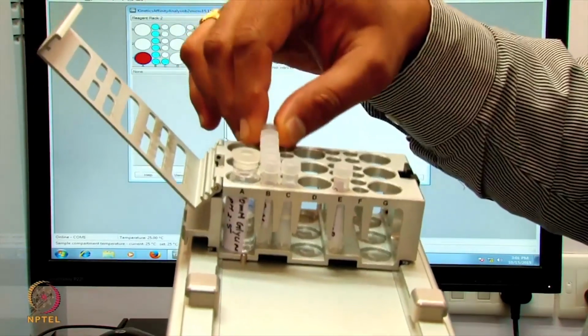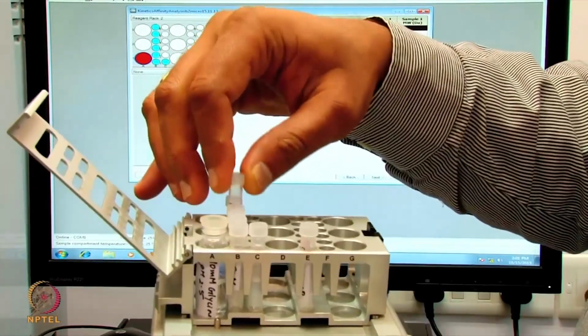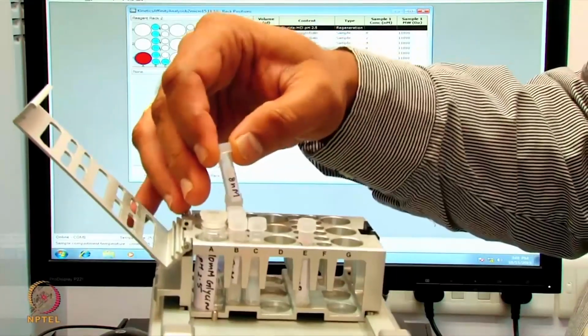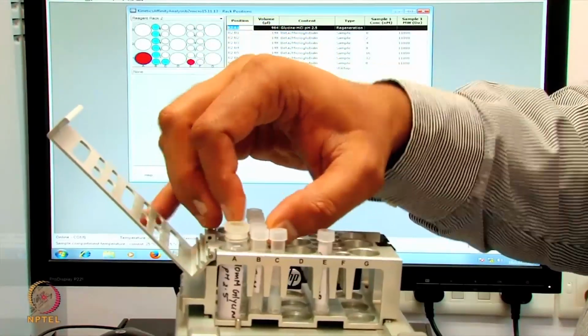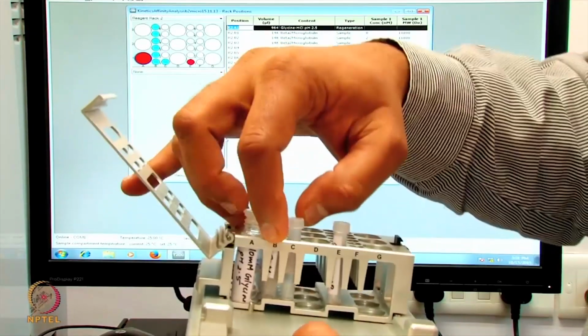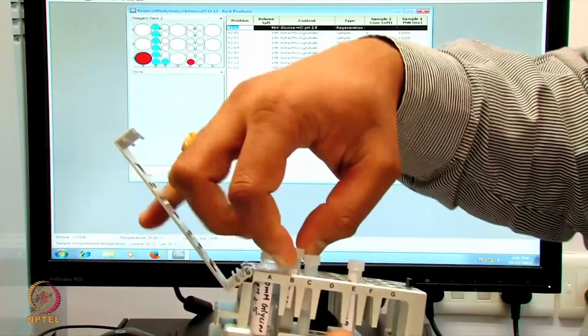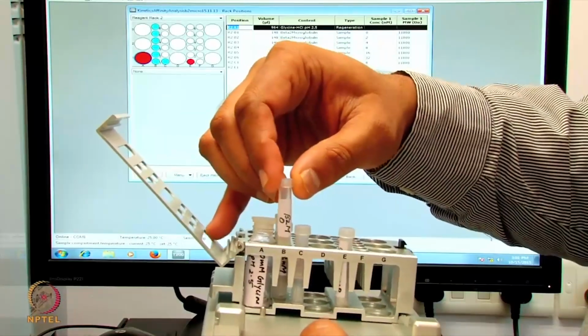So 32, 16, 8, 4, 2 nanomolar, and again 0.